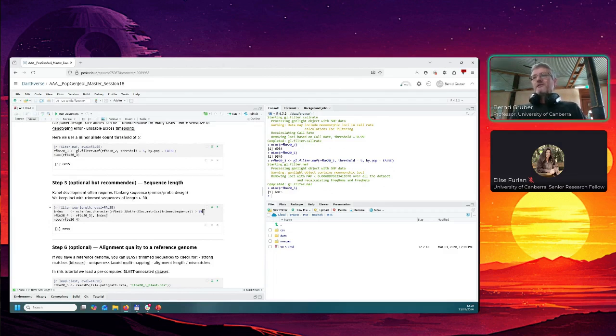And then there's an interesting one. When you get DArT data, and it's probably true for most of the other ones, you get back the length of the sequence for your SNP. So every SNP is basically a longer sequence, and normally you get 69 from DArT, or even longer, 128 bases of sequence information for each of the SNPs.